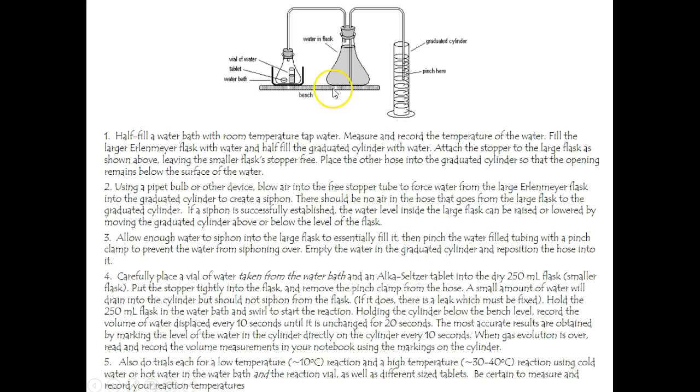And there it is. So you've got a water bath, you've got your tablet, you've got a vial of water, and it's sitting right up there. I would think that we could just tip that thing over by shaking it or something. The reaction begins. The gas is forced up to water in a flask, at which point the gas continues to go into a graduated cylinder, and it says pinch here. Okay, let's go ahead and read it.